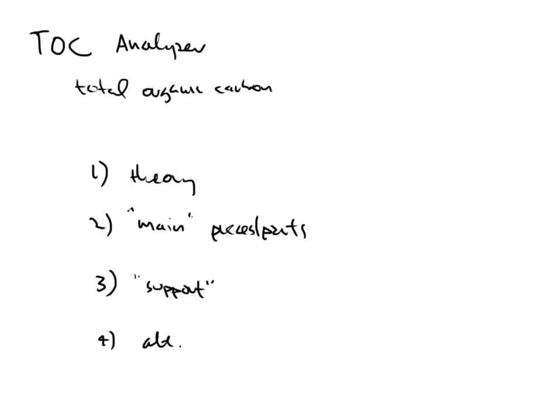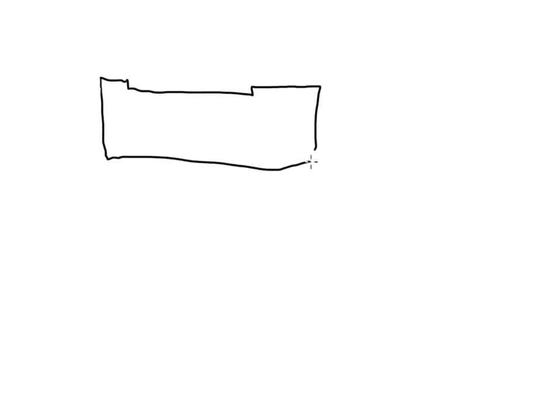Now, I keep talking about organic and inorganic, right? So I'm going to come back here and clear out this screen. On the periodic table, it will typically look something like this. If you've taken General Chemistry 1 or 2, you might have talked about the staircase. That staircase goes down like this, and it is a dividing line. Anything to the left of that staircase and anything to the right-hand side are grouped as two different types of atoms or elements.